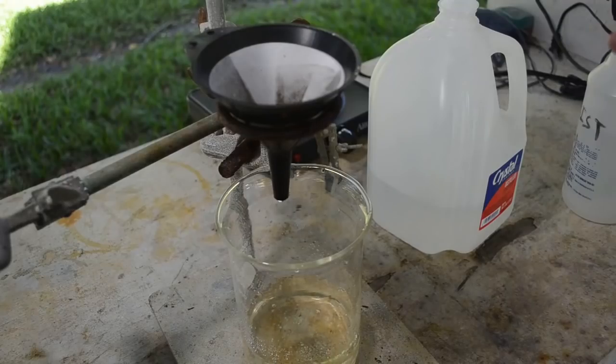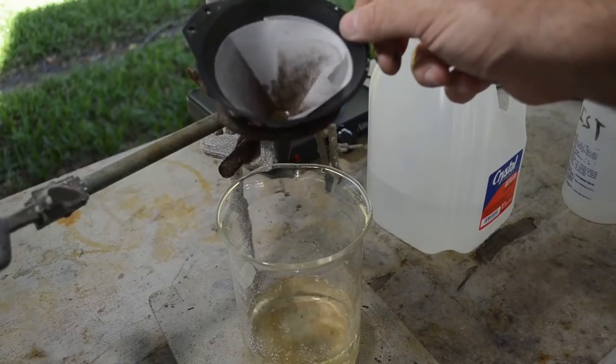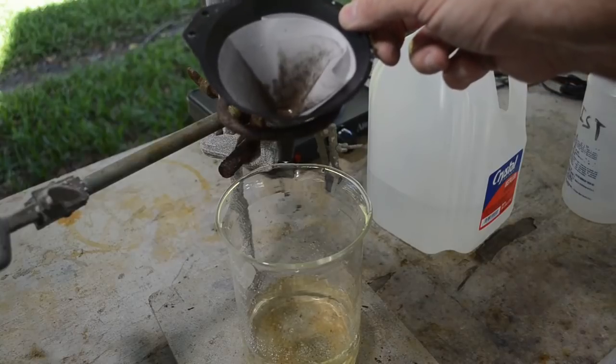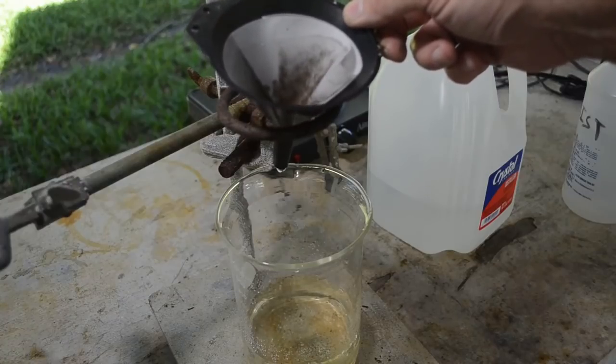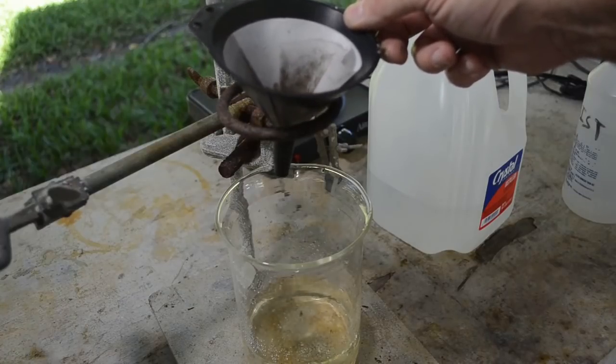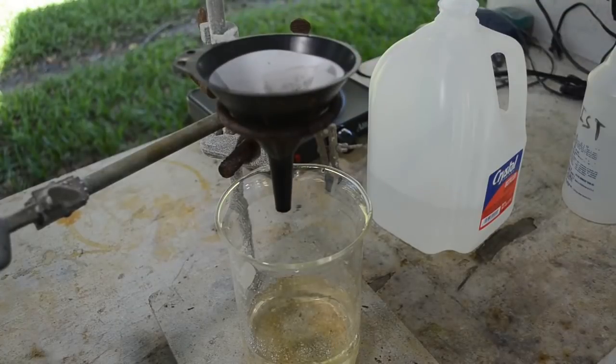When I drain the rinse water that I boil the gold in, I always drain it through a filter to catch any little fine gold caught in the water column, and I've got a little bit of gold there. Not a huge amount, probably not even enough to move the scale at all, but at least I caught it. It's not going to waste. And we'll get this stuff in the fume hood dried out and weighed up and see how much we got.